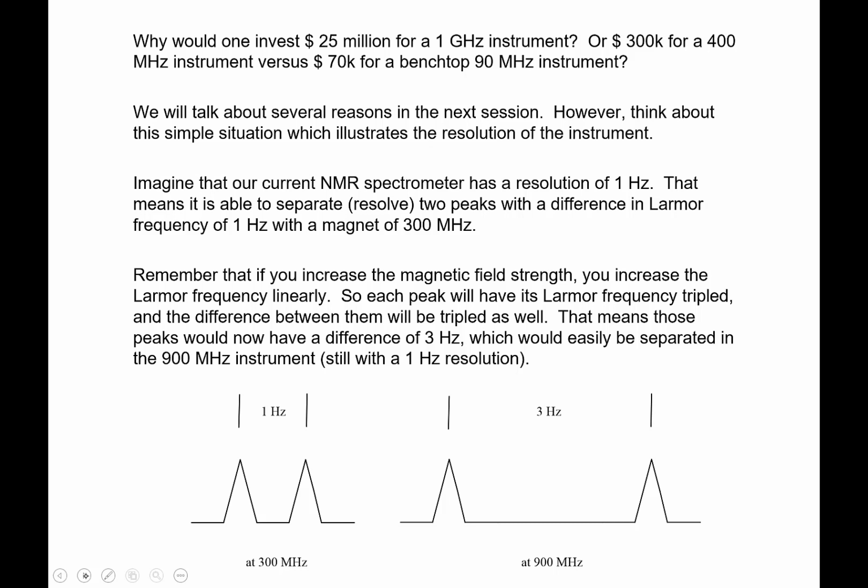It would be important because if you think about resolution and resolving two peaks in the spectrum, let's say you had two peaks that were hertz apart at 300 megahertz. Now, one of the things with radio frequency is that you can detect it and you can apply it with incredible precision. So you can detect a hertz difference out of 300 megahertz. Next week we're going to talk about that: 1 hertz in a million hertz. That's a part per million.